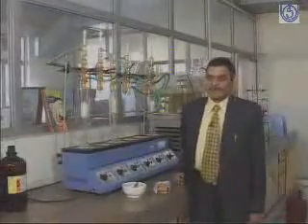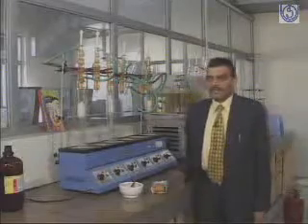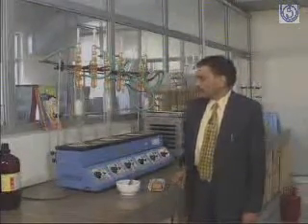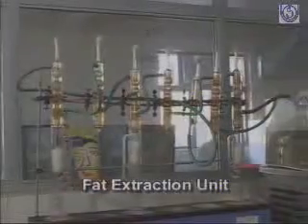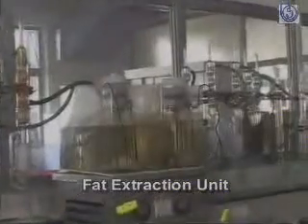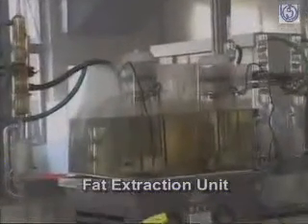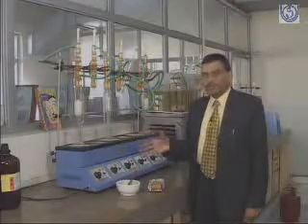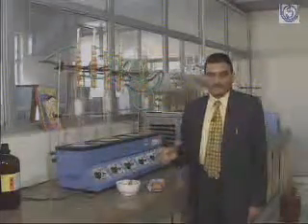Now we are in chemical section. I will let you know about the utility of some of the equipment in chemical section. This is fat extraction unit, and by this unit we extract the fat in any food product and know the quantity of the fat in a sample.